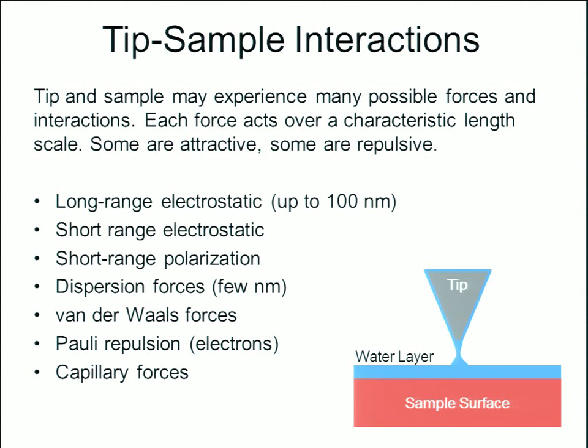Pauli repulsion, or basically electron repulsion. And also capillary forces. This is one that many users kind of neglect to consider, that there is a thin film of water on top of all samples and tips, which are playing a role in determining the interaction force here.